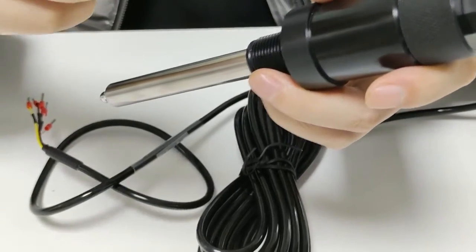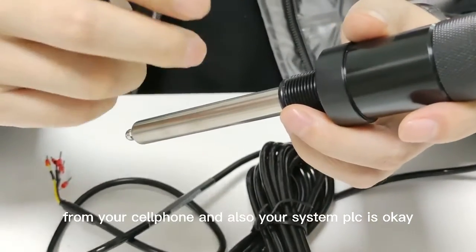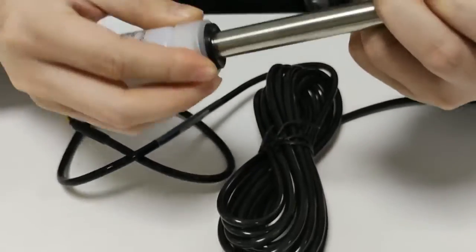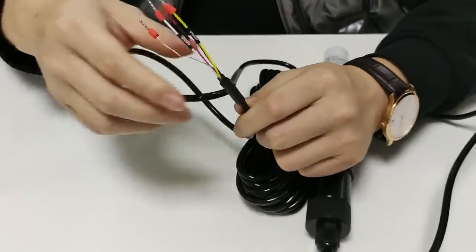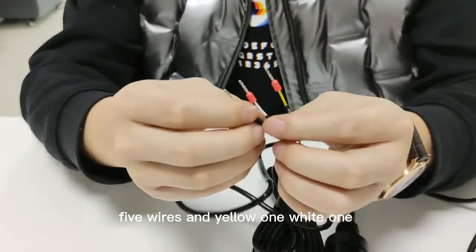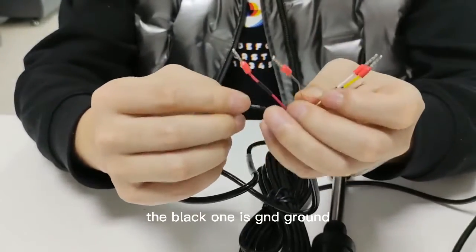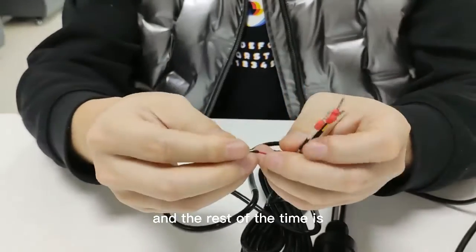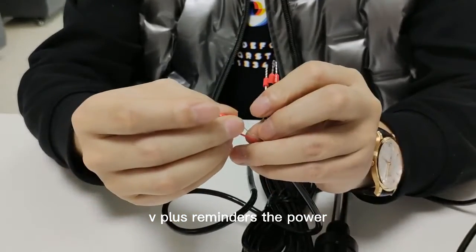You can get the data from your cloud, from your mobile phone, and also your system PLC. For the connection of the sensor, you can see we have five wires: the white one is 4-20mA, the black one is GND (ground), and the remaining two wires are V+ and V- for power.